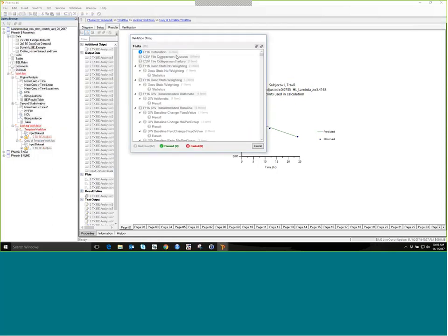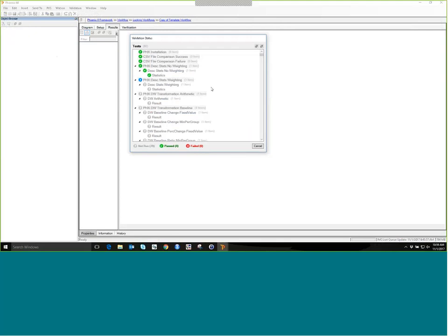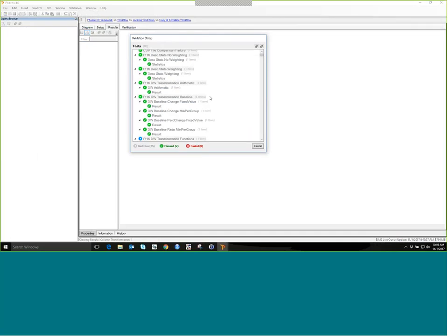You can see there's a blue circle, which means it's actually running the Phoenix installation test right now, and all of these ones have not been run yet, and it'll actually show you what is being compared. So you can see the comparisons running. The green ones are the tests that have passed, they've been completed, and they're ongoing. You can see Phoenix flashing in the back because it's running Phoenix to do all these calculations, but I'm free to work on other applications on my computer. So it runs pretty quickly, and you can see it's pushing through those. It's got 8 done already in just a few seconds.